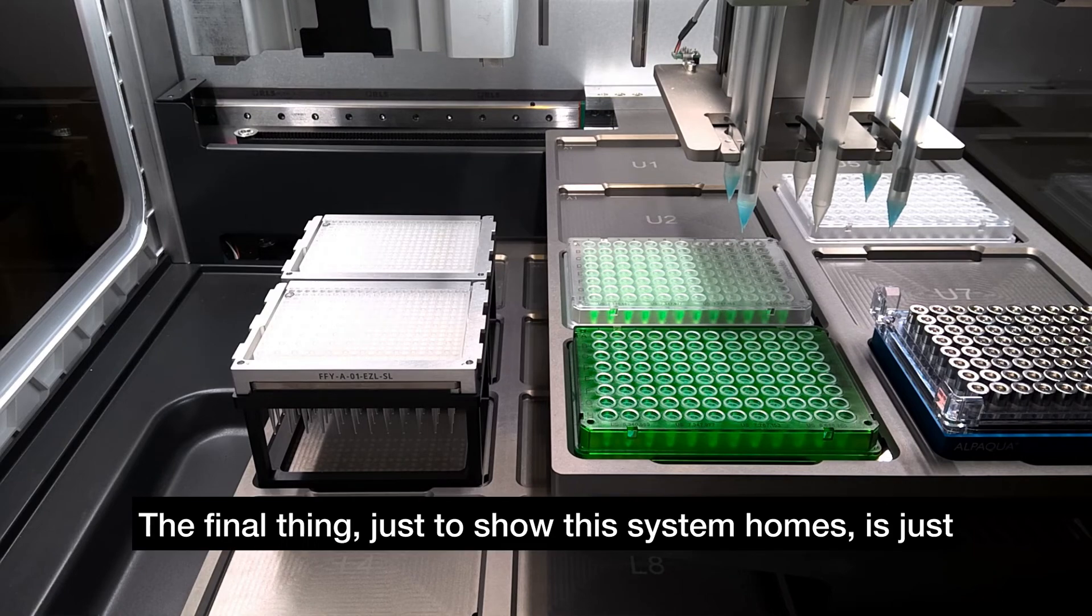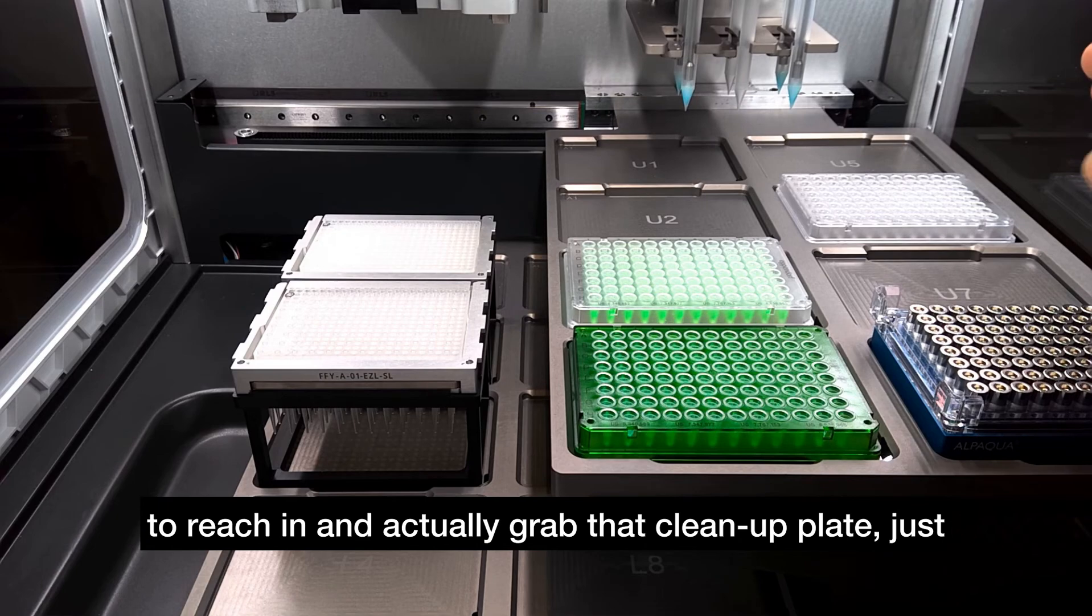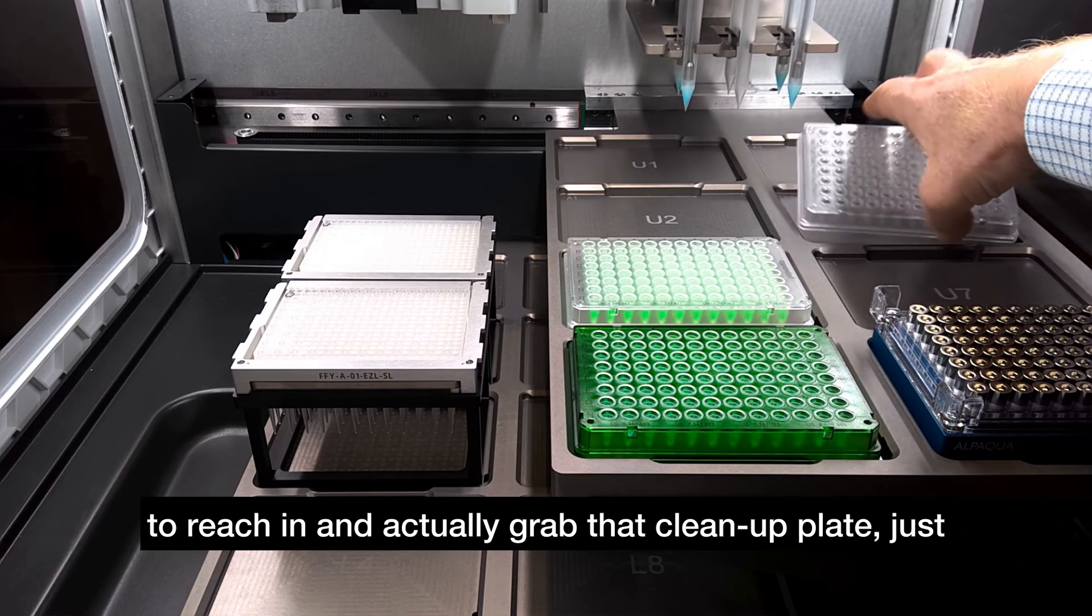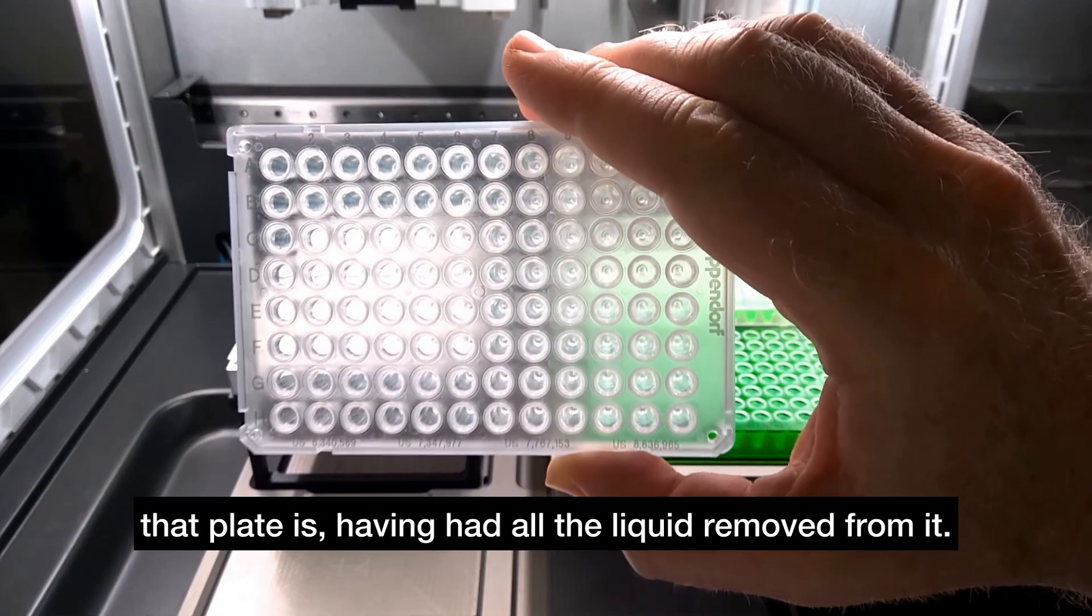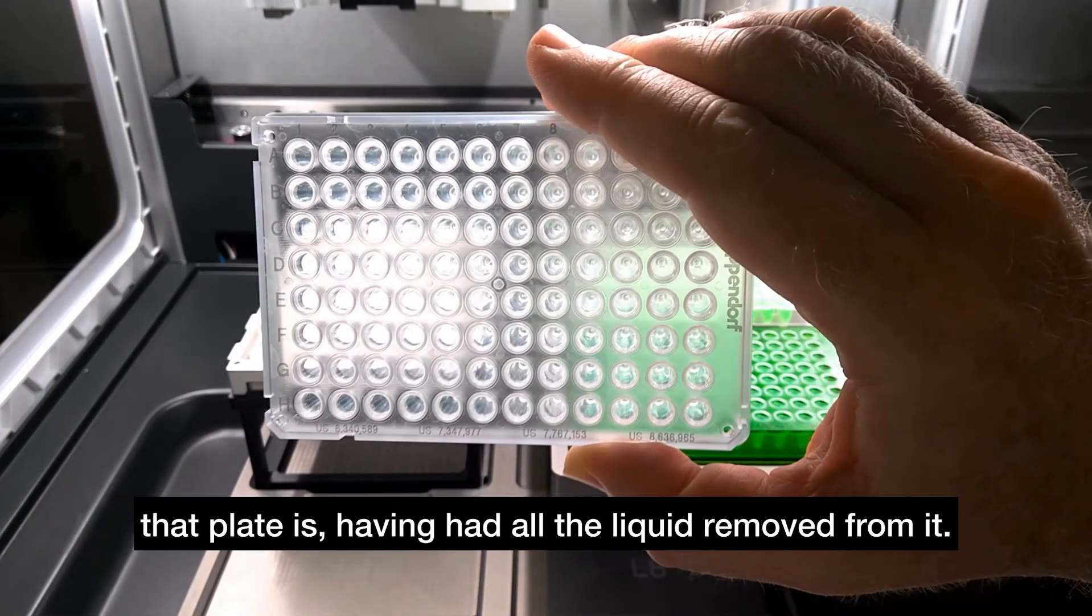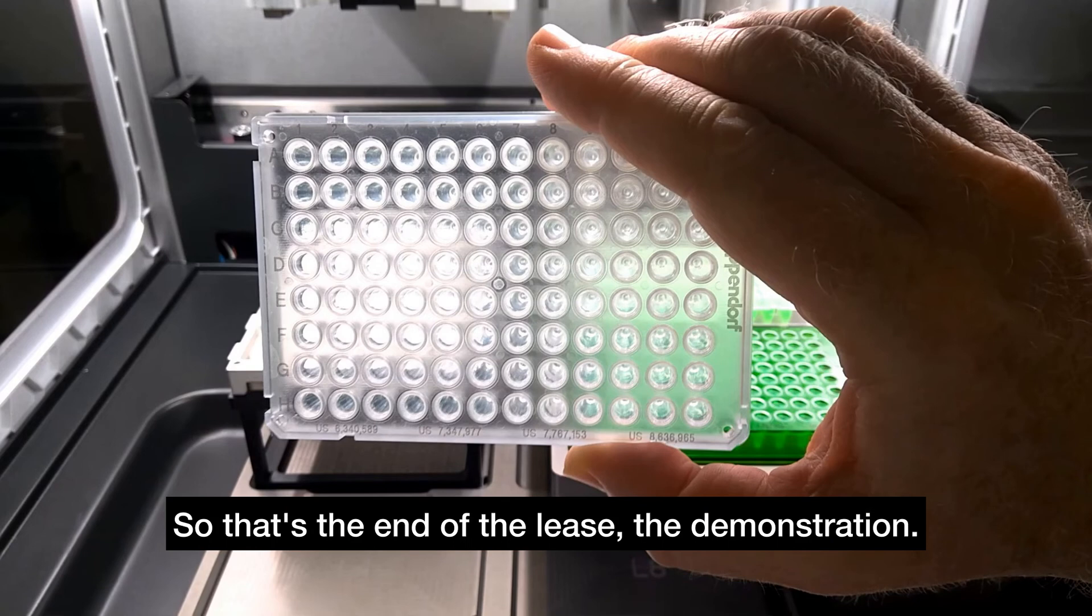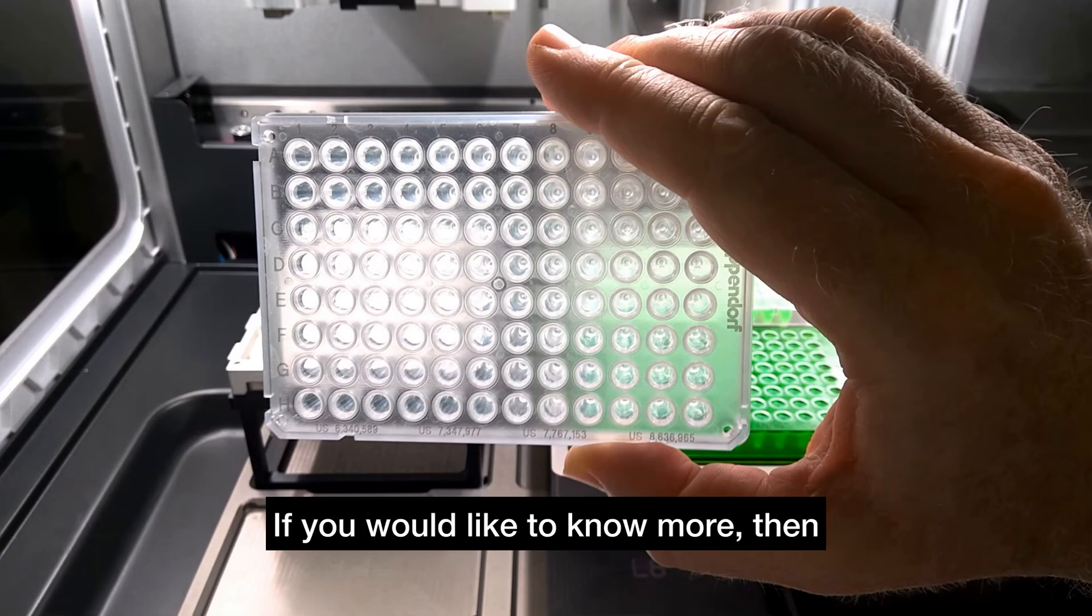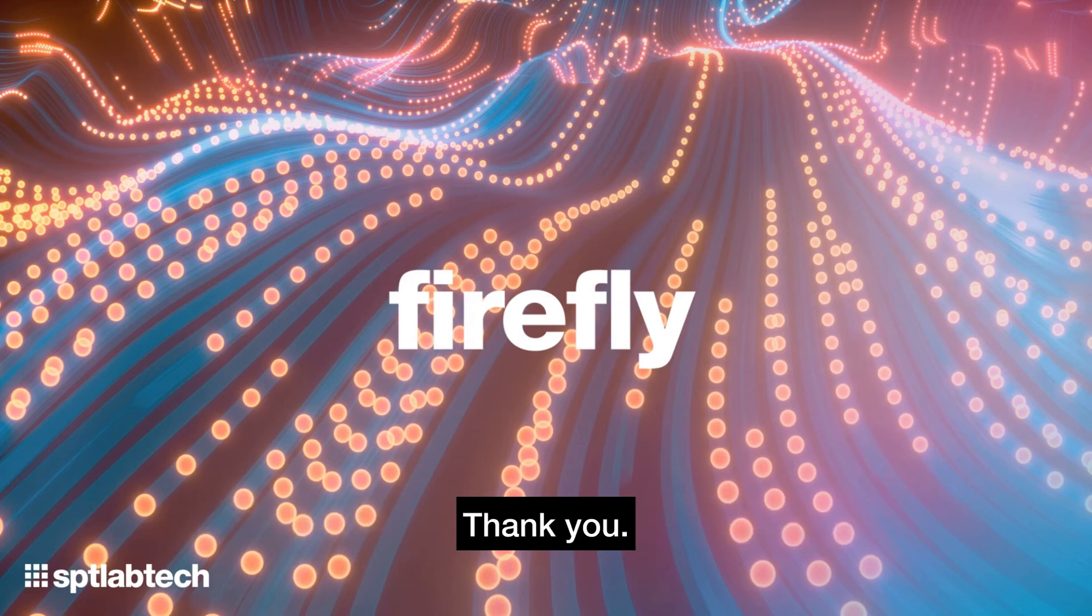So the final thing just to show as this system homes is just to reach in and actually grab that cleanup plate just to really give you a good idea of just how clean that plate is, having had all the liquid removed from it. So that's the end of the demonstration. If you would like to know more, then please contact SPT Lab Tech and we'd be happy to provide you with further information. Thank you.